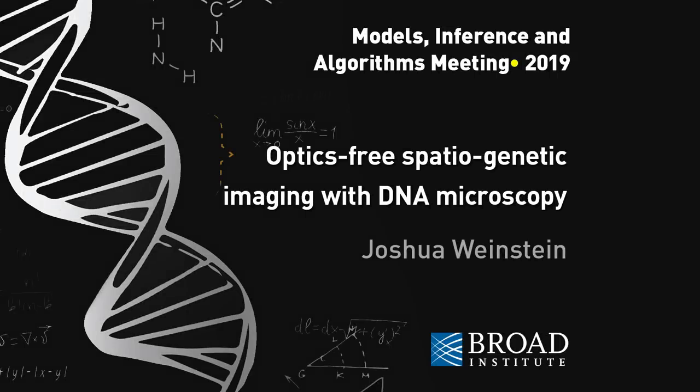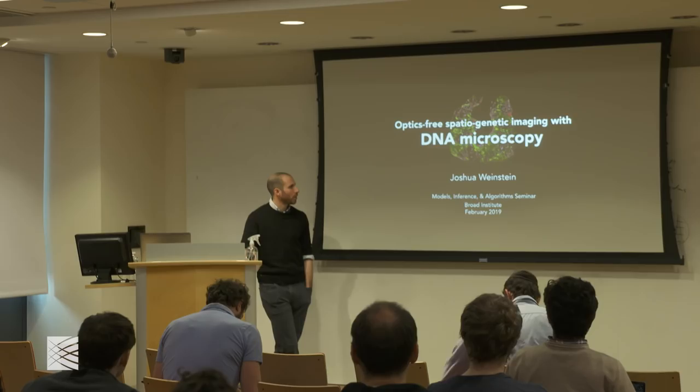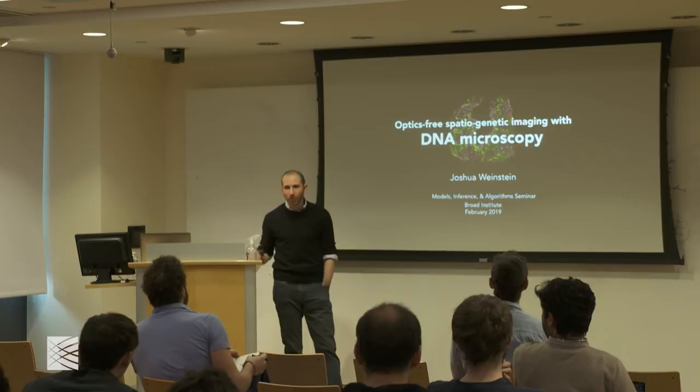I'll be telling you about DNA microscopy, which is a technology that I've been developing for the past few years that captures spatial and genetic information within a single measurement.